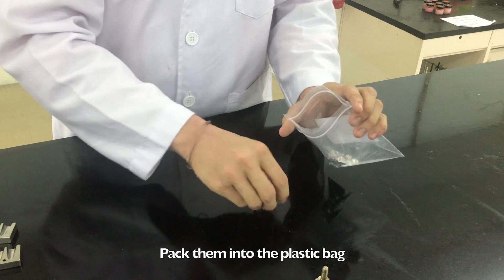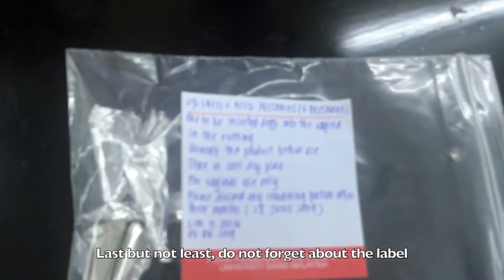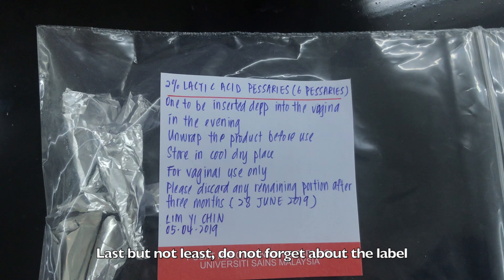Then, pack them in a plastic bag. Last but not least, do not forget about the label. Make sure you put down: 'Unwrap the product before use,' and the most important one, 'For vaginal use only.' And don't forget to put down the expiry date, which is 3 months after the preparation.